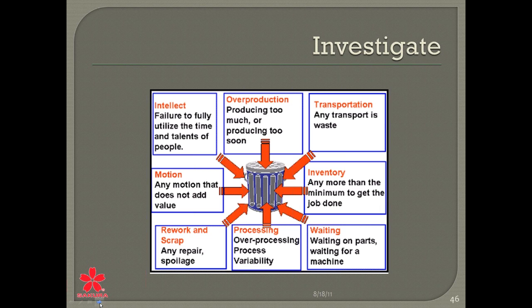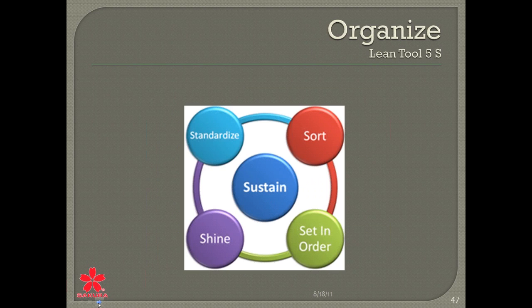So you have to investigate where all the wastes are, and then get rid of all those wastes because we don't like them. So there are a lot of wastes in here. Maybe waiting on microtomy is a type of waste, and you can get rid of it. And how did we do this?